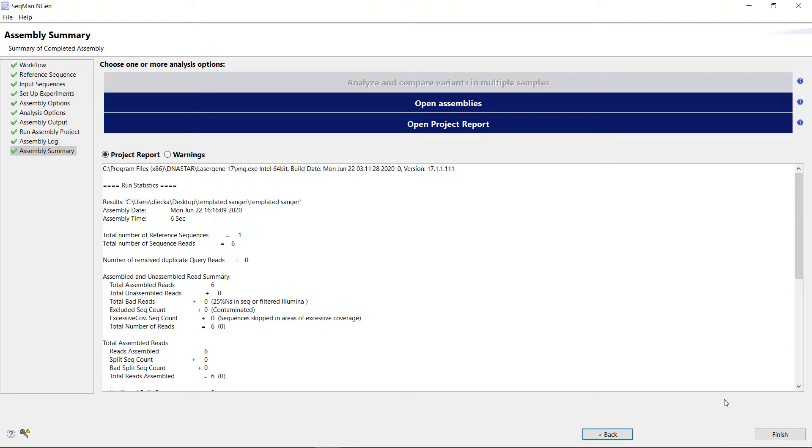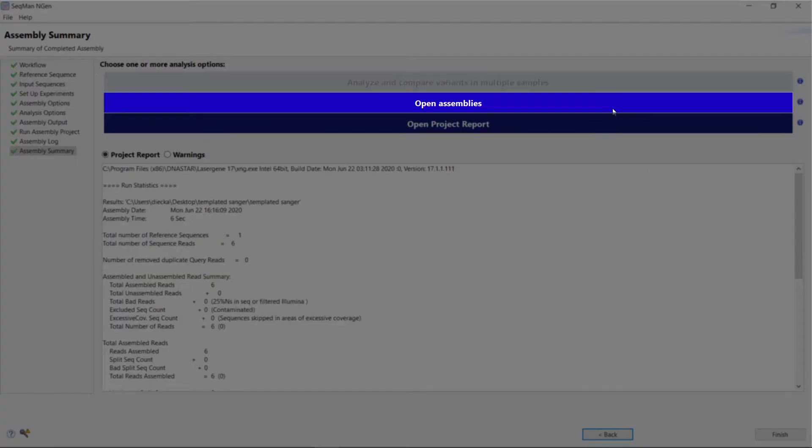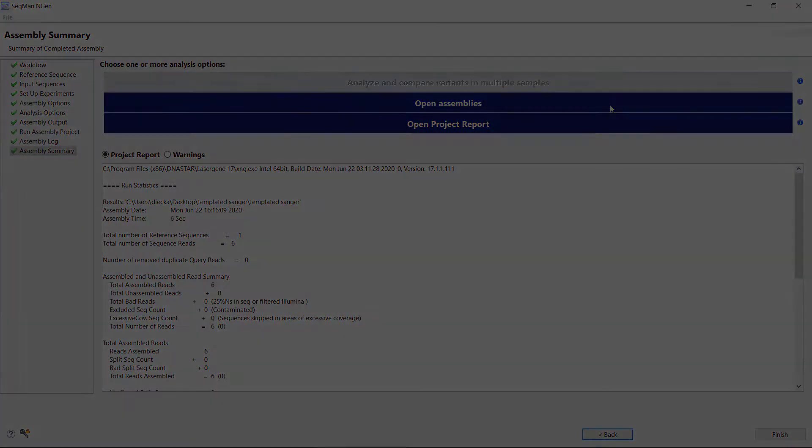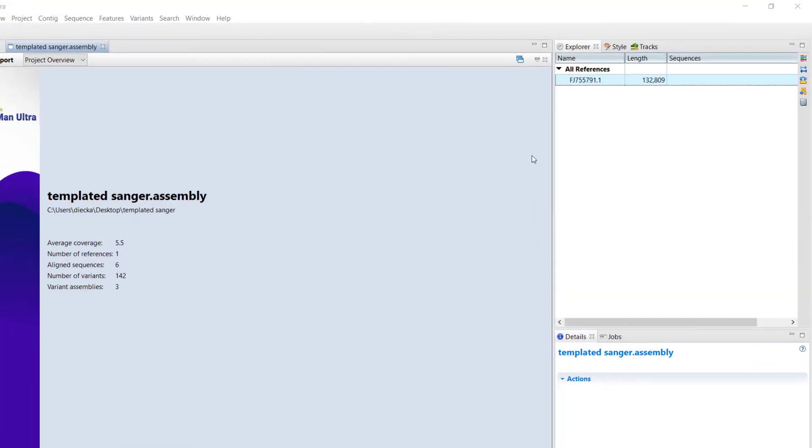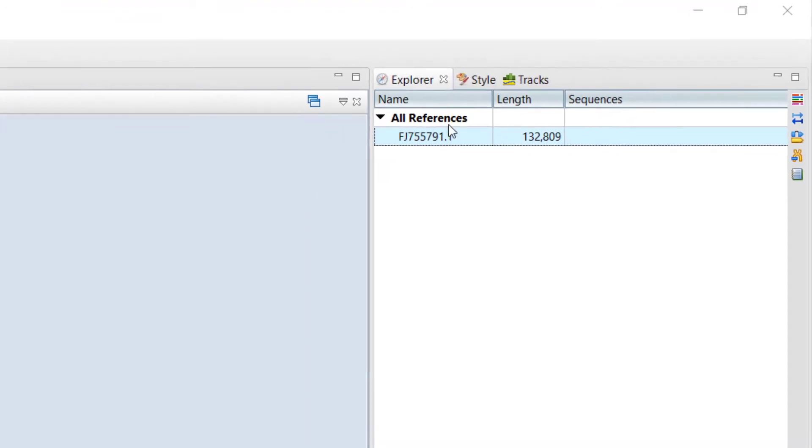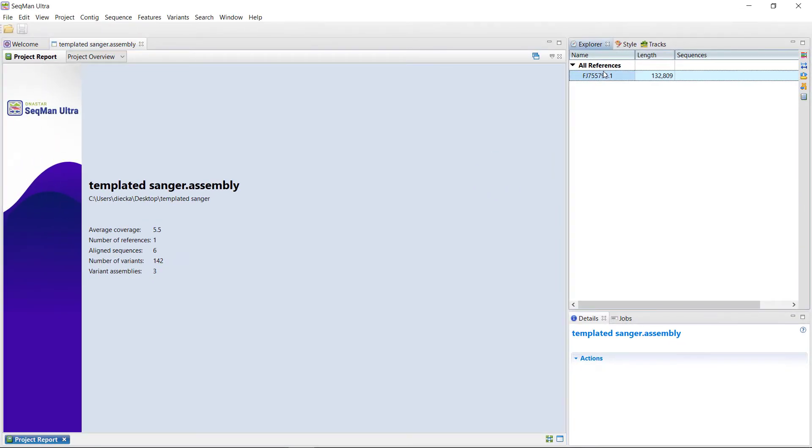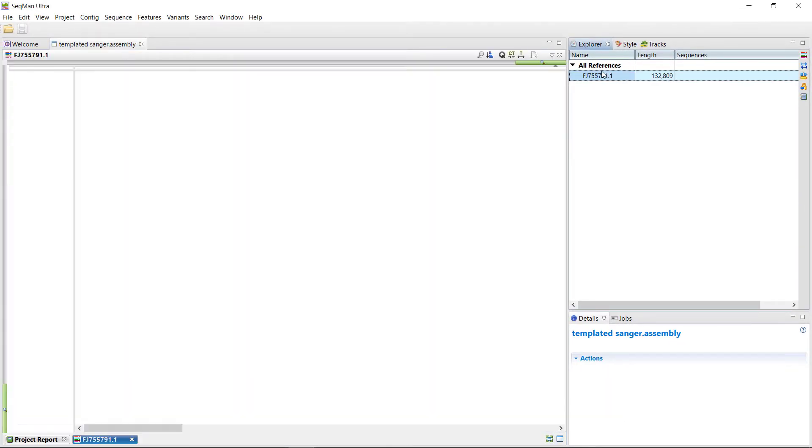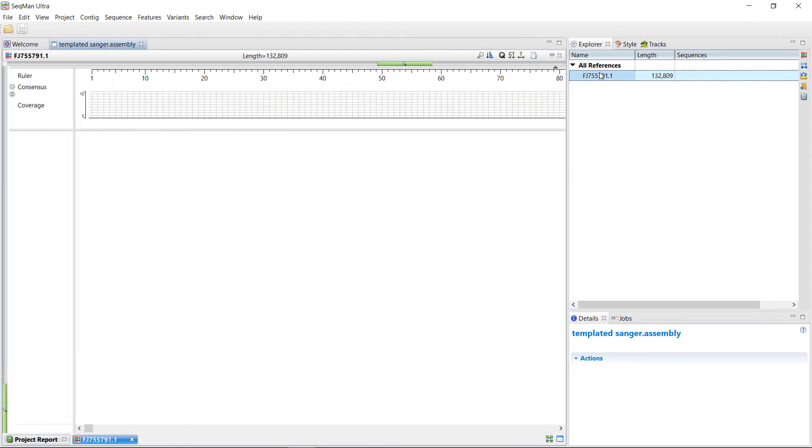On this screen, click Open Assemblies to launch SeekMan Ultra. Under the Explorer tab on the right, you will see a single contig named after the GenBank file used as the reference. Double-click on the contig name to open the alignment view.